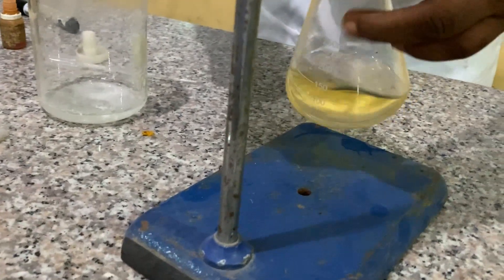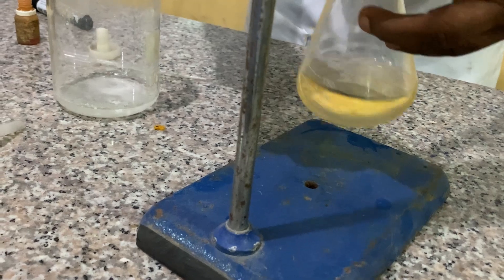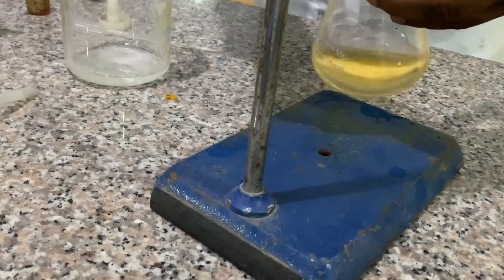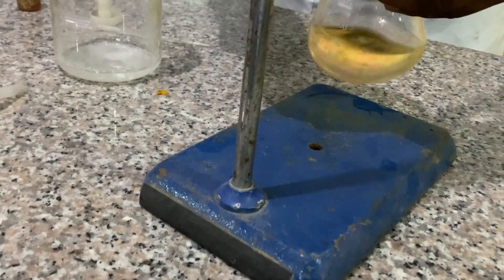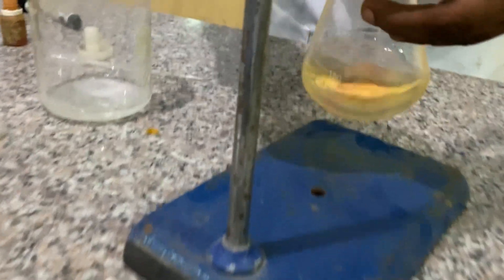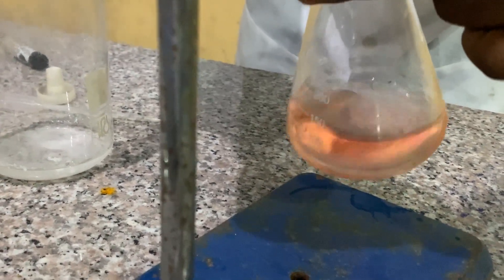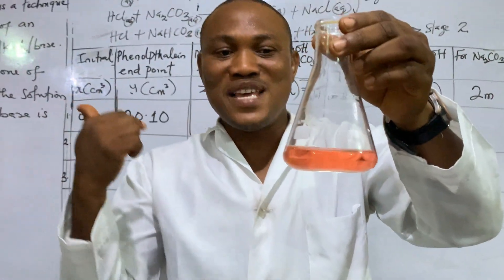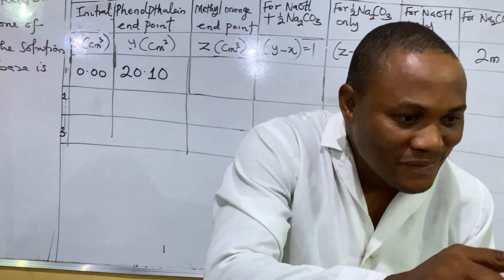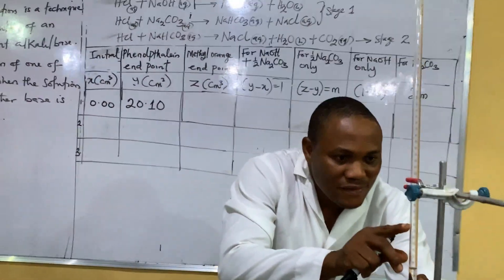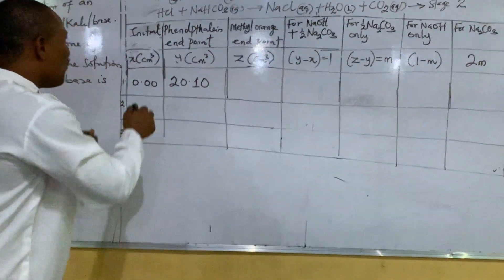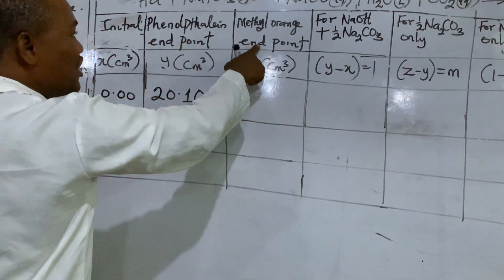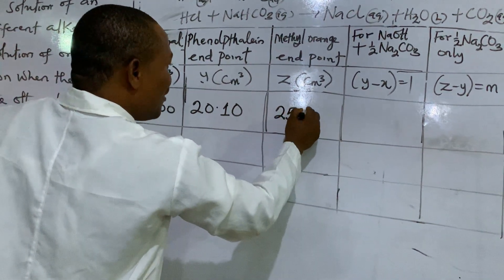So let's see this now — let's go. Let's check it. Did you see the color change? Chemistry is interesting! Did you see the color change now from yellow? This is the color change. So let's check: 20... 25.10. Did you see that? So which means at the methyl orange endpoint I have 25.1.